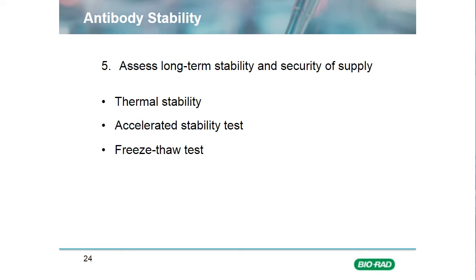Now, whilst antibodies themselves are inherently stable when either frozen or in the presence of microbial inhibitors, in the sense that the molecules do not fall apart, loss of function over time can be seen with some clones, particularly when we're talking about monoclonal antibodies. And this is probably most likely the result of aggregation. So assessment of the stability of the antibodies early on in your validation process can help weed out any clones that may have stability issues, and this in turn may save time and energy further down the line.